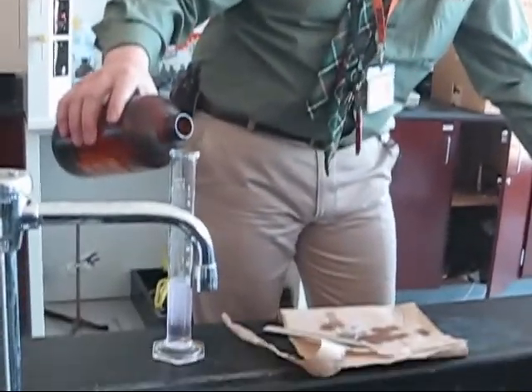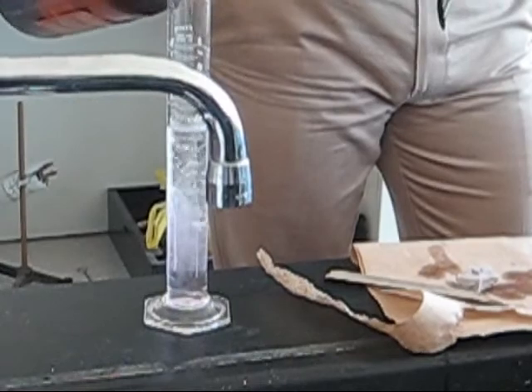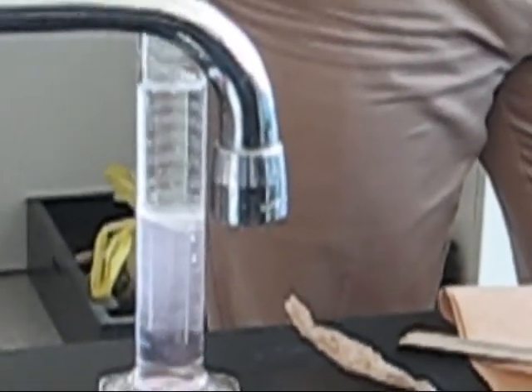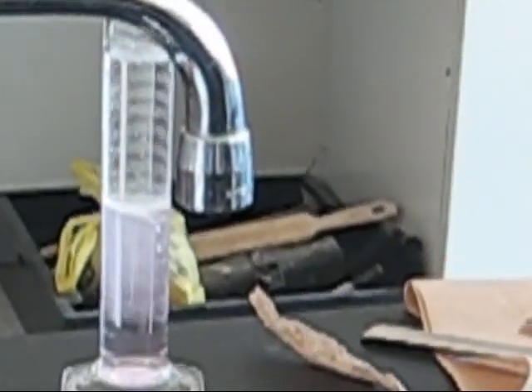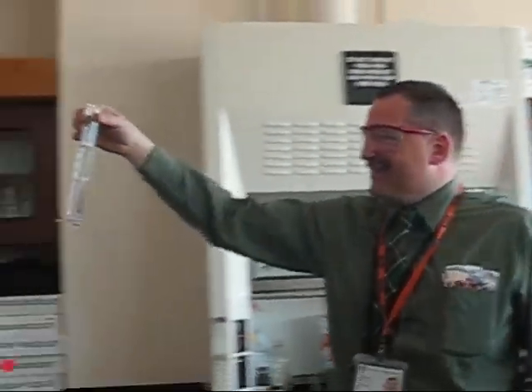Now, this is a light mineral oil. This is a distillate from crude oil, so it's got a pretty low density. I can tell it's less dense than water. How can you tell? Because it's on top of the water.